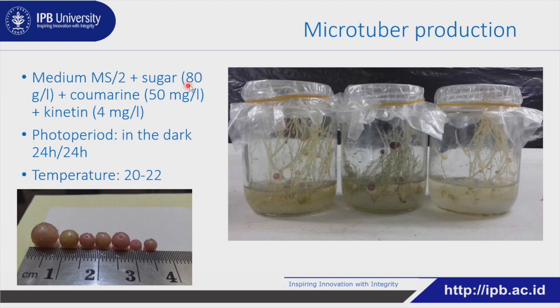We should also use a retardant such as coumarin and kinetin, and then we pour it in the media because it's a liquid media.